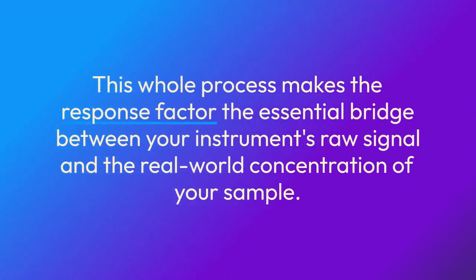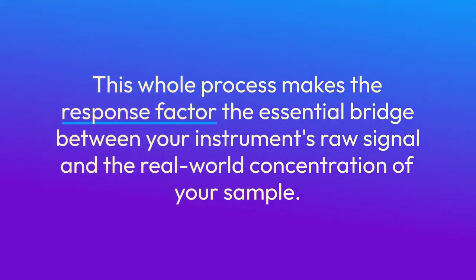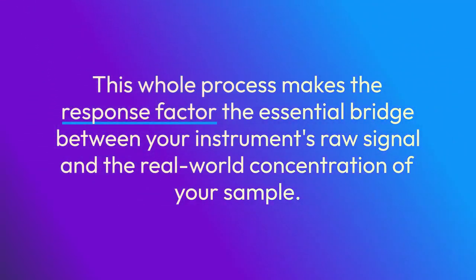This whole process makes the response factor the essential bridge between your instrument's raw signal and the real-world concentration of your sample.